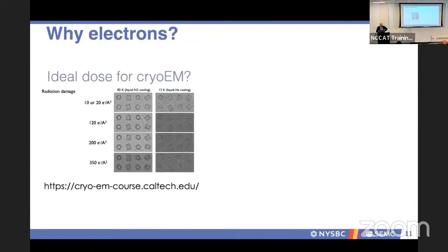And it depends on what you're after. And that's why, on the scope of the scale of biology that I was showing you, an electron microscope can be used as a microscope and access different resolution regimes.